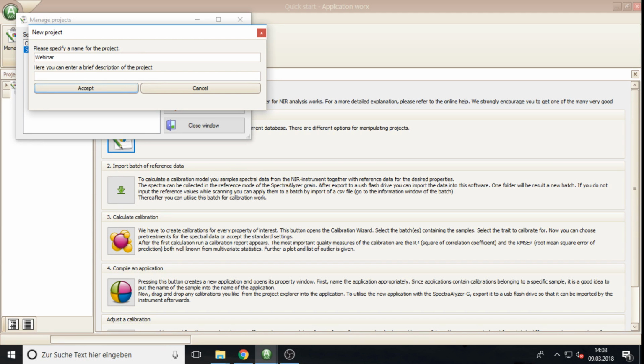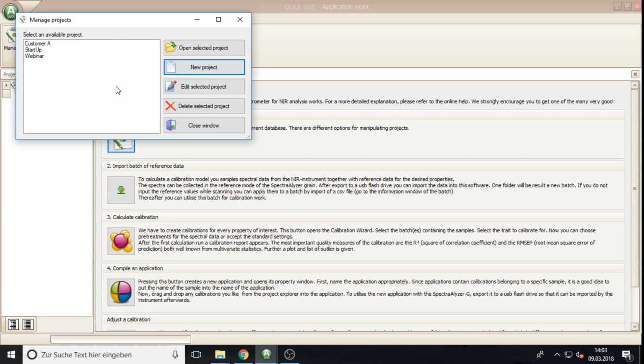And if you like to, you could put here a comment so that you later on know what this project was about. So let's call it Webinar from 9th March 2018. Then click OK, and then you will find your new project here in this list of projects.